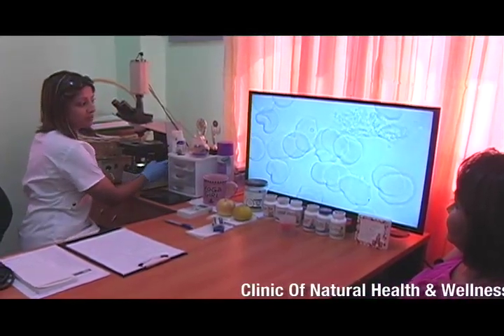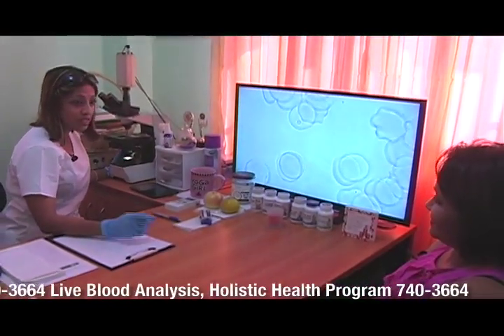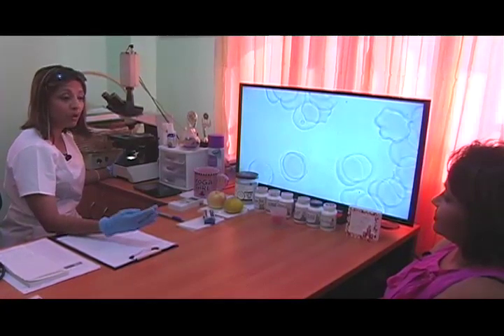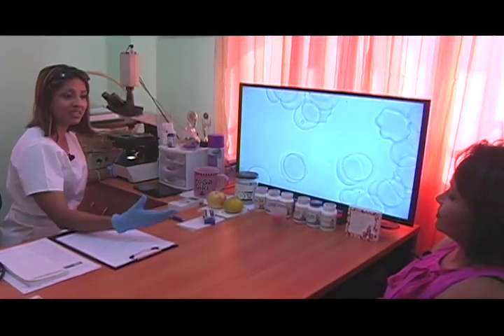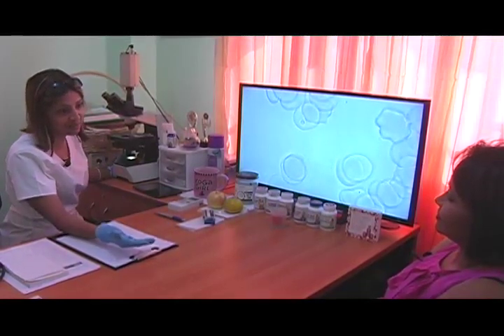What I also noticed is some fibrinogen as we were moving through the blood, which is liver stress and liver congestion. What causes liver stress? Well, one, if you have a lot of emotional stress. Two, even painkillers, certain medication. Three, if your bowels are toxic, if you're constipated, you're not having proper bowel movements. Remember, you need at least 2 to 3 movements for 3 meals, right? So you'll need more fiber, water, and exercise to stimulate peristalsis, the muscular contraction needed for good bowel movements. And also, if your digestion is compromised, the liver takes the licks from the digestive system. Okay?